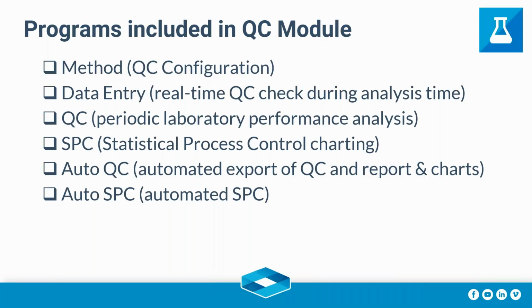Okay, to recap, the programs that we have used so far to illustrate the functionality of the QC module include: method, the one that we use for configuring our QC, number of QCs and placement, and also the expected value, etc. Data entry for real-time QC checking during the analysis time. QC analysis, which is for our laboratory performance analysis. SPC charting.